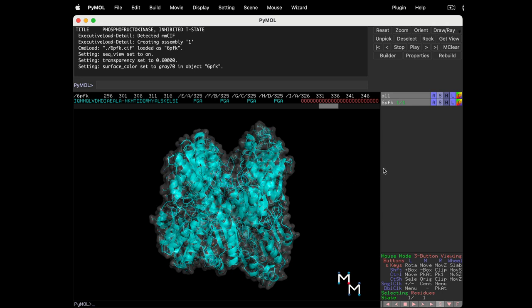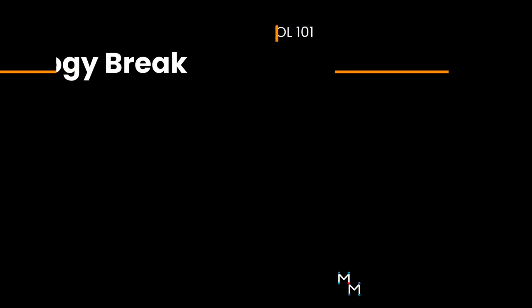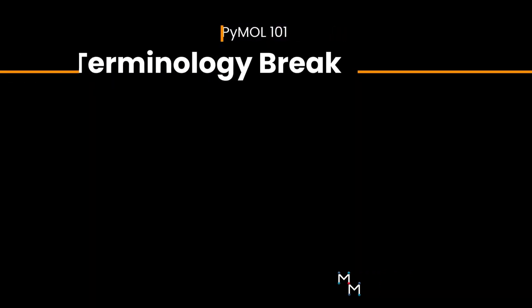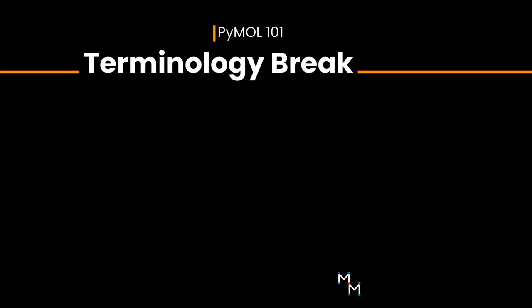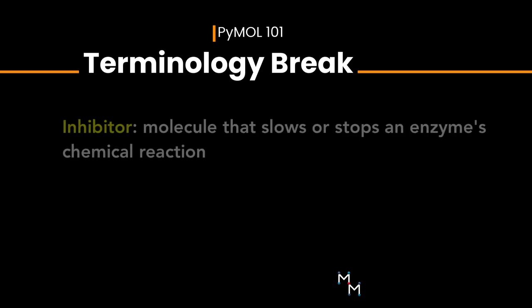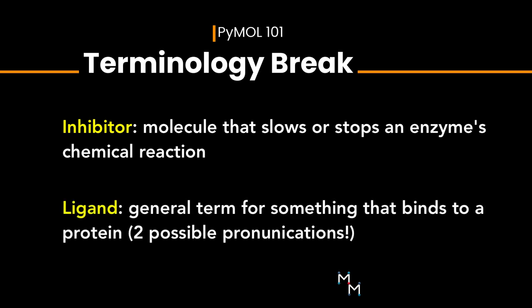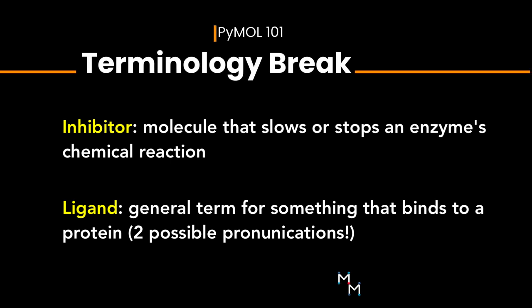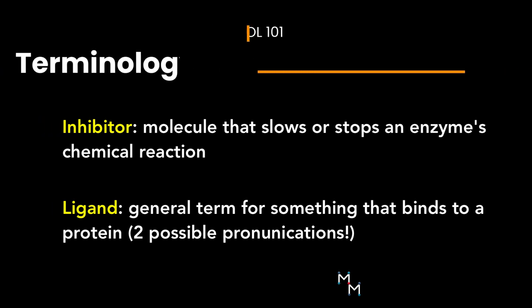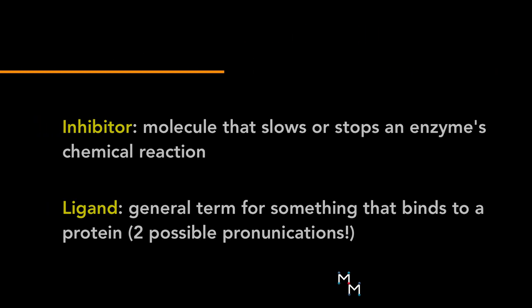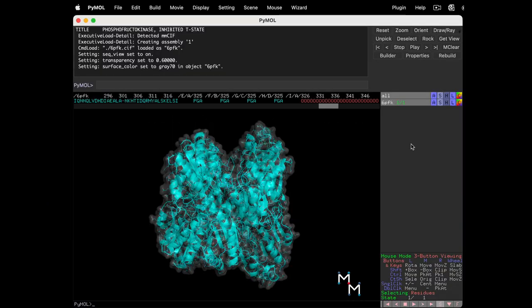Next, we'll play with the rendering of PGA. But before we do that, a quick terminology break. We mentioned this is the less active conformation, and PGA helps force the enzyme into this shape because it's an inhibitor. Inhibitors slow or stop an enzyme from performing a chemical reaction. And anything that binds to a protein can be generally called a ligand. So the inhibitor is a ligand.